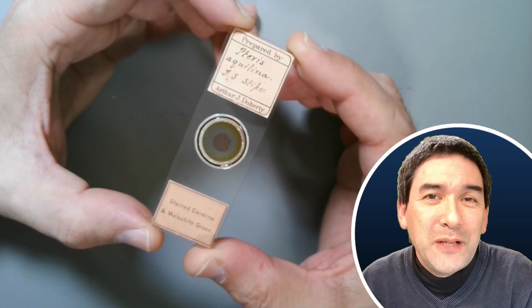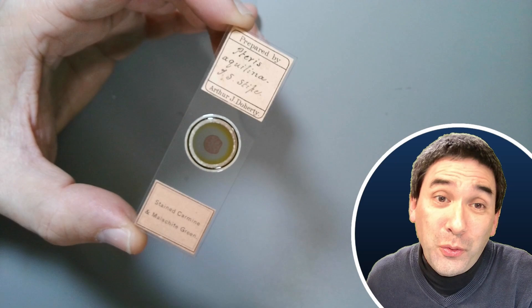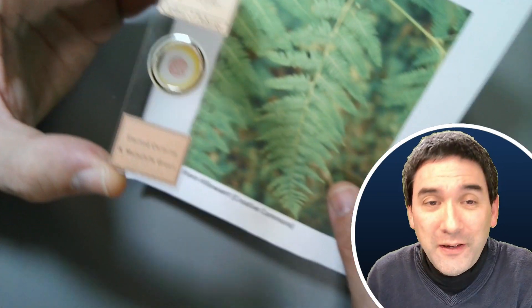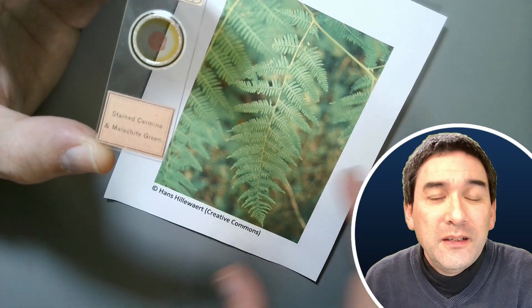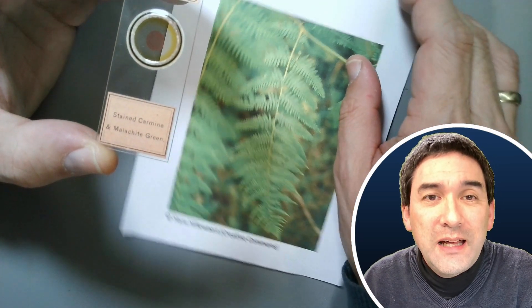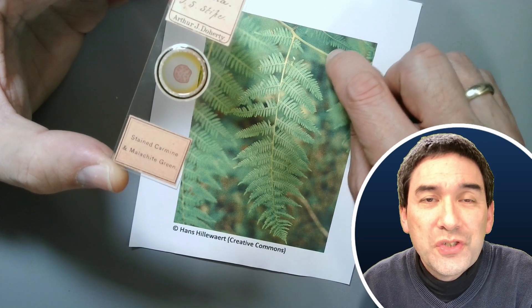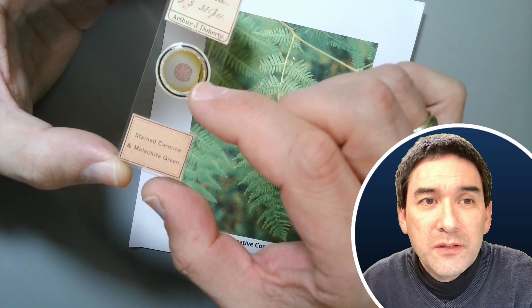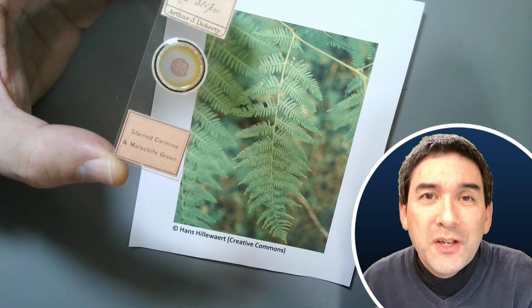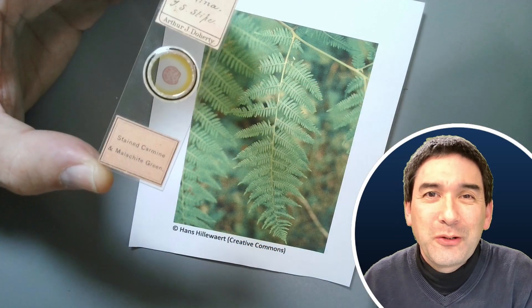So what I'm going to do now is first of all, show you a picture of the fern here which I found. That's the so-called eagle fern. And here it is. And we're looking at the cross section of one of those stems here. And you can see that it's fairly large here. So let's put it under the microscope and then let's have a closer look.